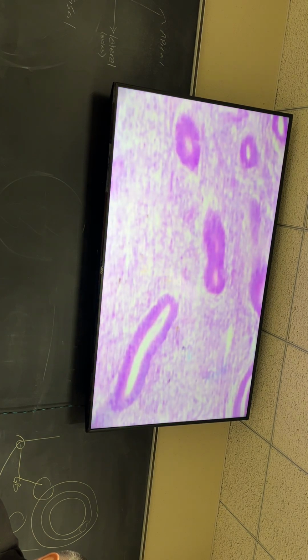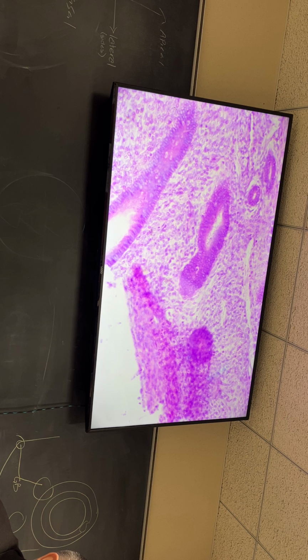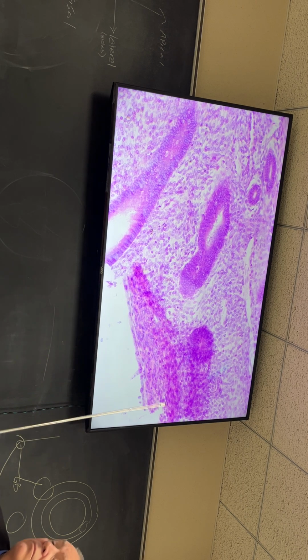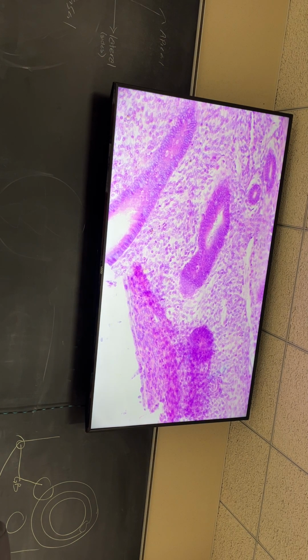There's not a lot of them in there. There's some in there, don't get me wrong, but they're a little harder to see. There's a nice vein there. How about that one? Fairly clear on that one, I hope. Everybody see the vein? Right? Doesn't have the epithelium, right? Can you show us on the picture? I don't know, because both look like they have the epithelium.